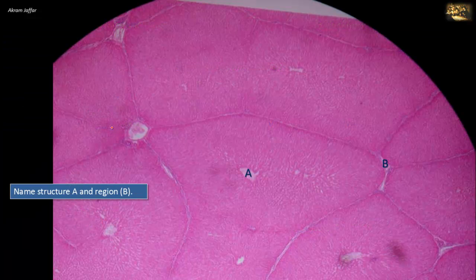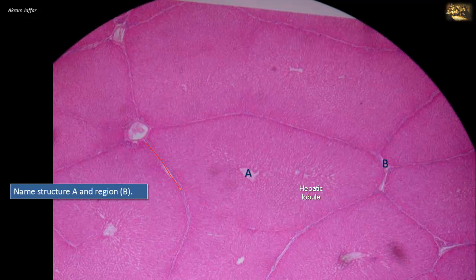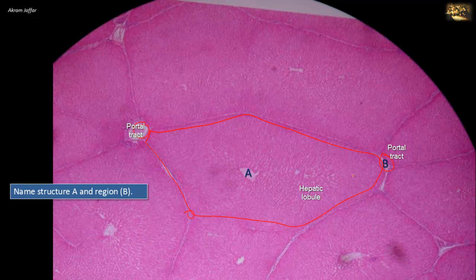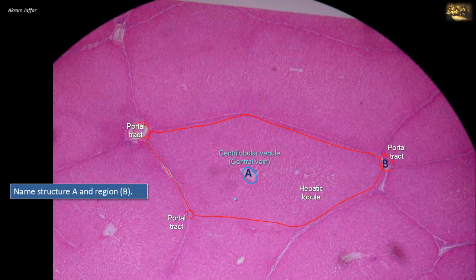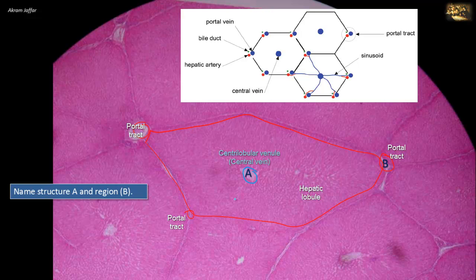Name structure A and region B. The section shows parts of the classical structural unit of the liver — the hepatic lobule — with its roughly hexagonal shape surrounded by connective tissue, and portal tracts at the corners. Region B represents a portal tract, while in the center of the hepatic lobule is a central vein, also called a centrilobular venule. The portal tracts at B contain three main structures: a branch of the hepatic artery, a branch of the portal vein, and a tributary of the bile ducts — hence the name portal triad.